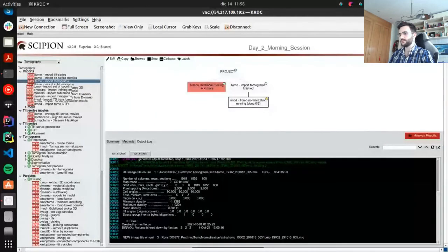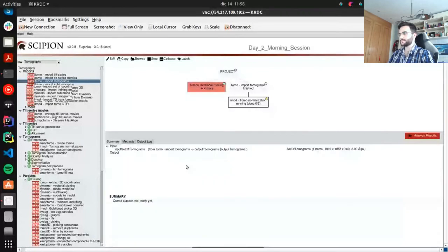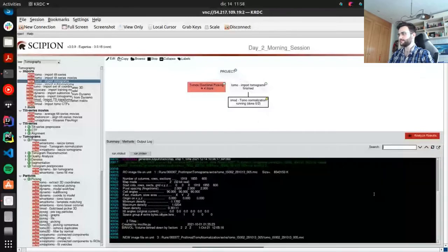So let's wait until it finishes. And if you have any other question in the meantime, you can click on refresh to see if it had finished. Seems there were some problems, but Jorge's already trying to solve them.